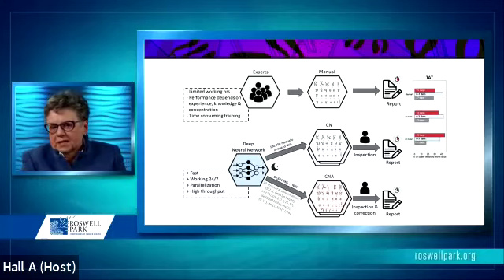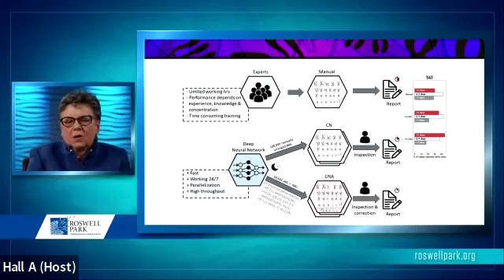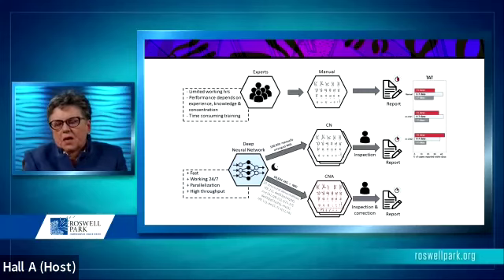And they were very successful, with 98.6% accuracy, with only chromosomes 4 and 5, and 14 and 15, which are commonly confused by experienced technologists as well. So where is the saving going to come in? Well, if an experienced technologist is performing chromosome analysis on their own, it'll take anywhere from 1 to 3 minutes.